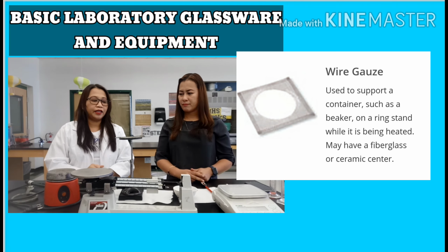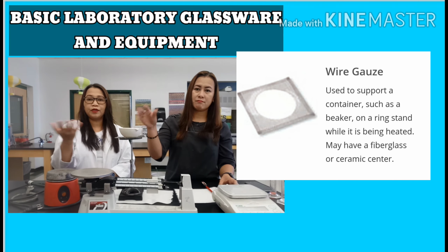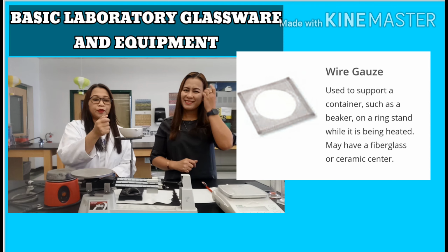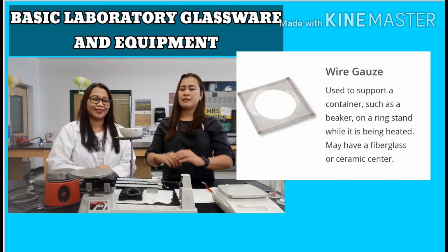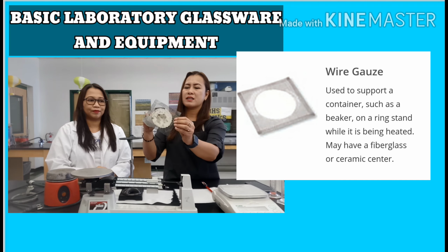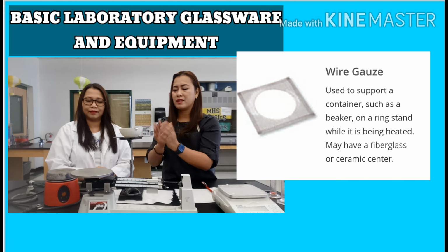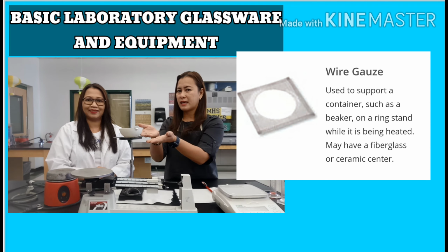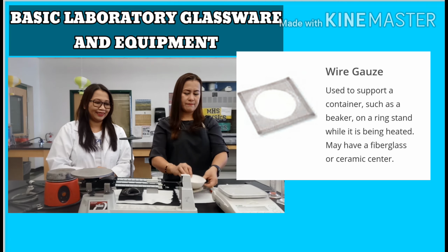And then if you want to heat some substance, you put it in this evaporating dish, and you turn on this Bunsen burner. The use of your wire gauze is for you not to have a direct contact between your source of heat and the glassware or any materials that you put at the top. All right.